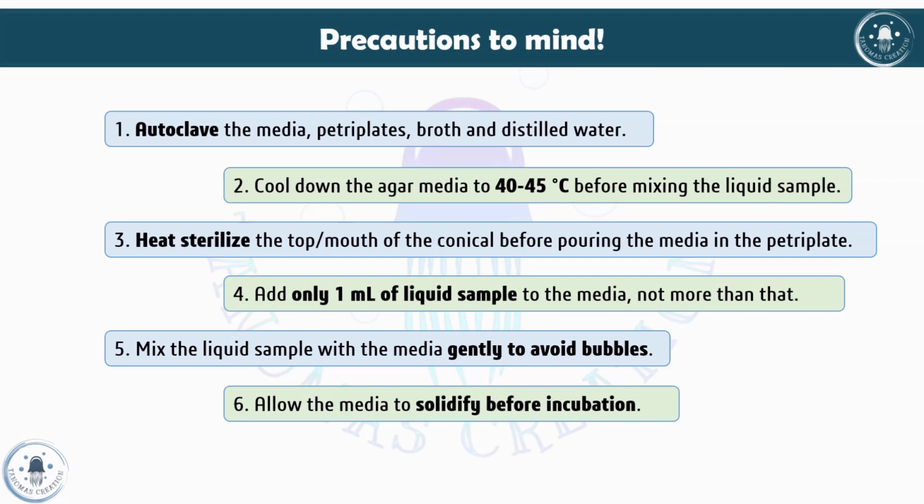And the last one is allow the media to solidify before incubation. Suppose you have put the media on the Petri plate, you have mixed it properly and then you have put it immediately in the incubator. This is not a proper process. Okay, you need to solidify it after closing the lid in the laminar itself, and then you put it in the incubator. Okay, so these are some of the precautions that you need to keep in mind in the pour plate technique.